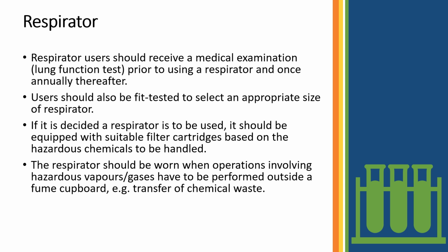Respirator. Respirator users should receive a medical examination and lung function test prior to using a respirator and once annually thereafter. Users should also be fit tested to select an appropriate size of respirator. If it is decided a respirator is to be used, it should be equipped with suitable filter cartridges based on the hazardous chemicals to be handled. The respirator should be worn when operations involving hazardous vapors or gases have to be performed outside a fume cupboard, for example, transfer of chemical waste.